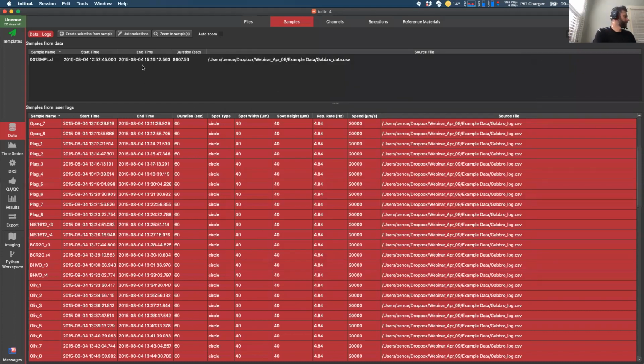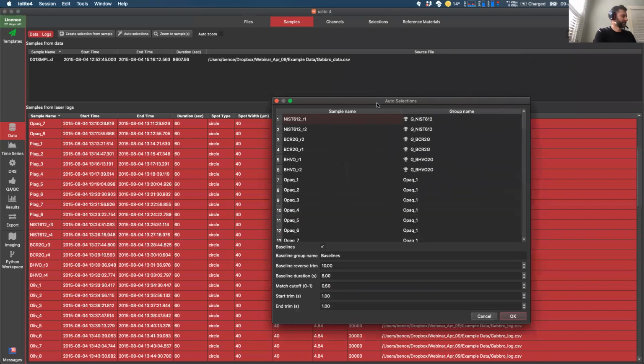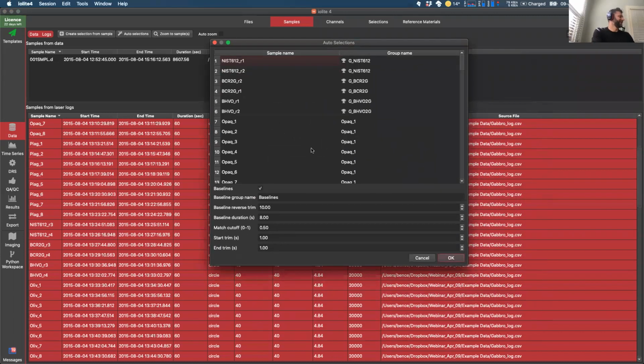Oops. Oh, I shouldn't push enter. I think I've just destroyed all my selections. So about 0.5 is about right.